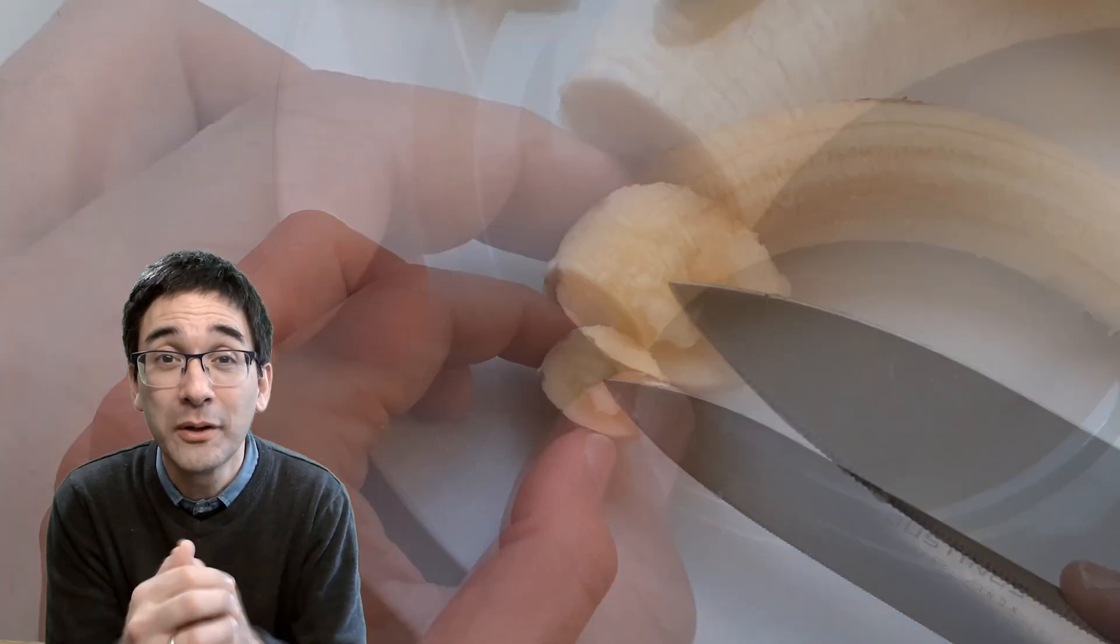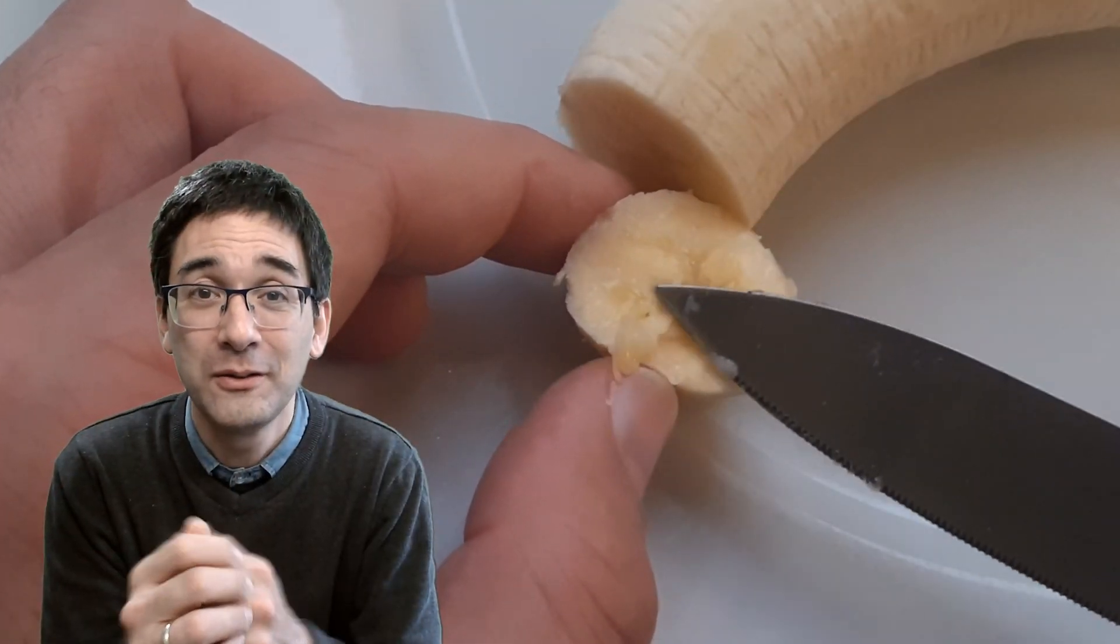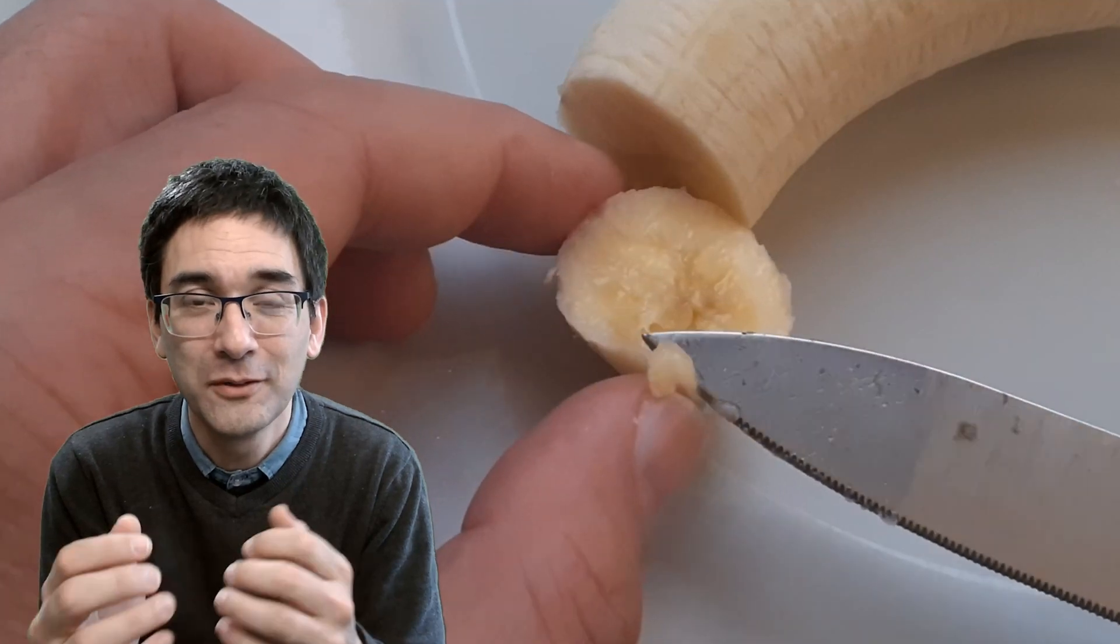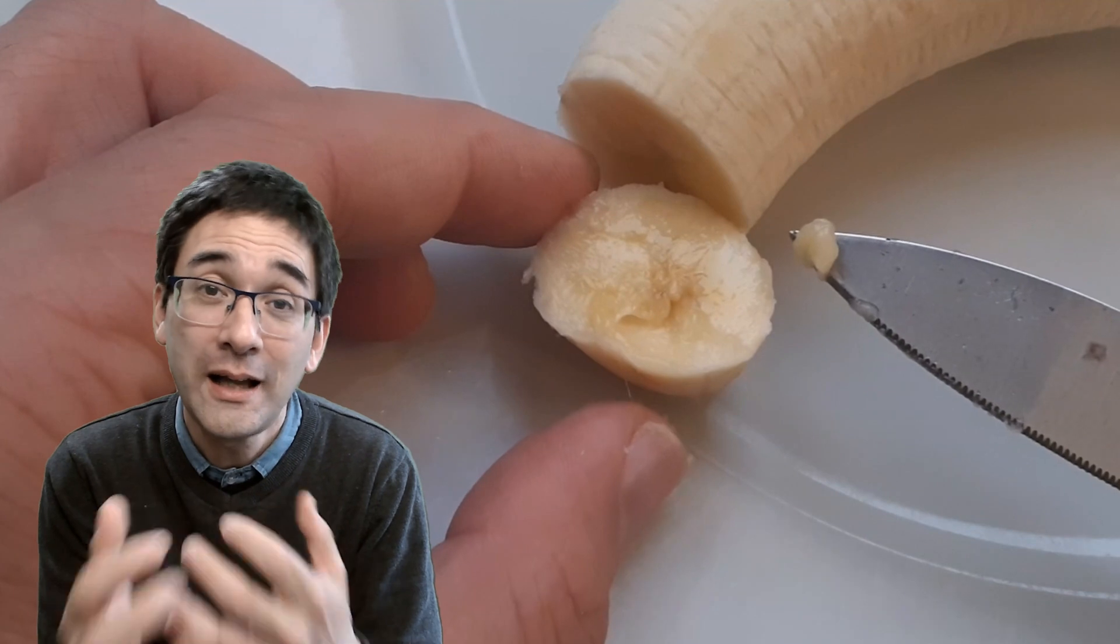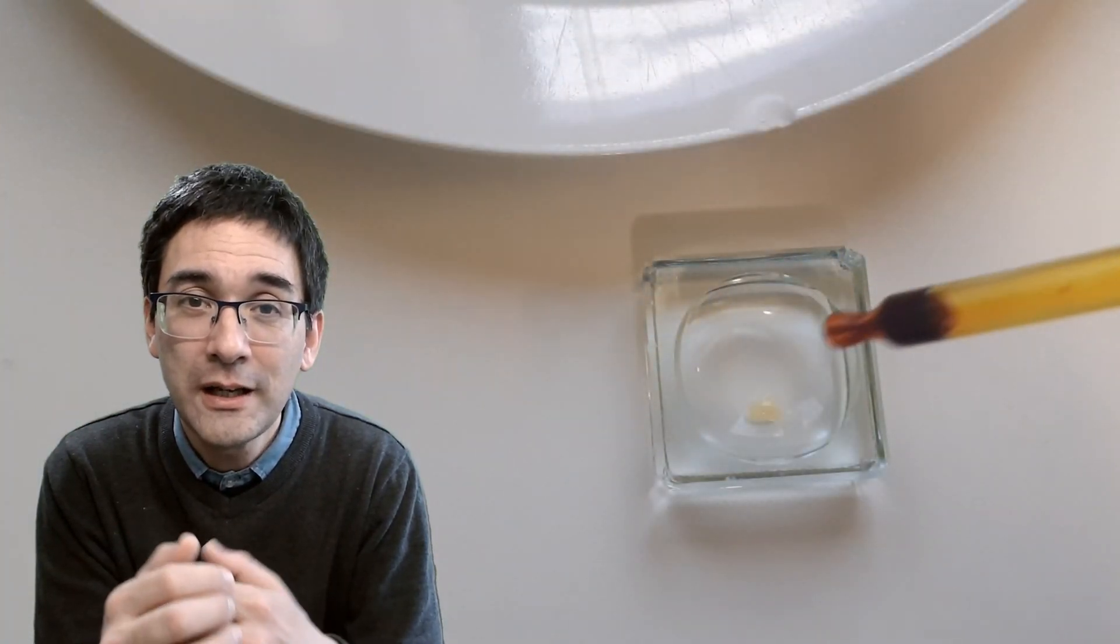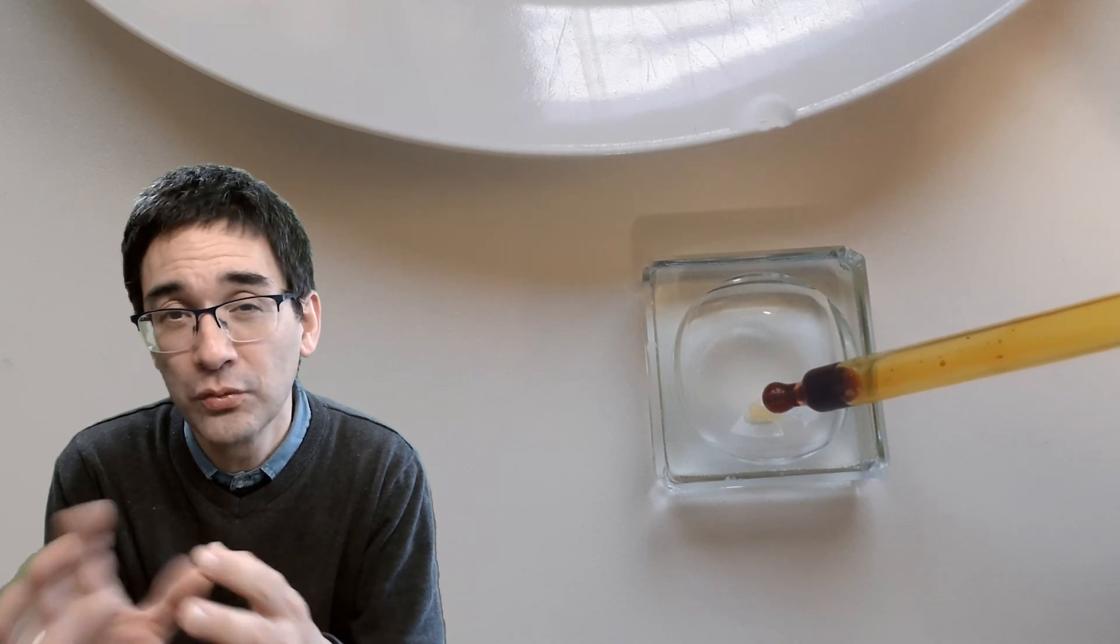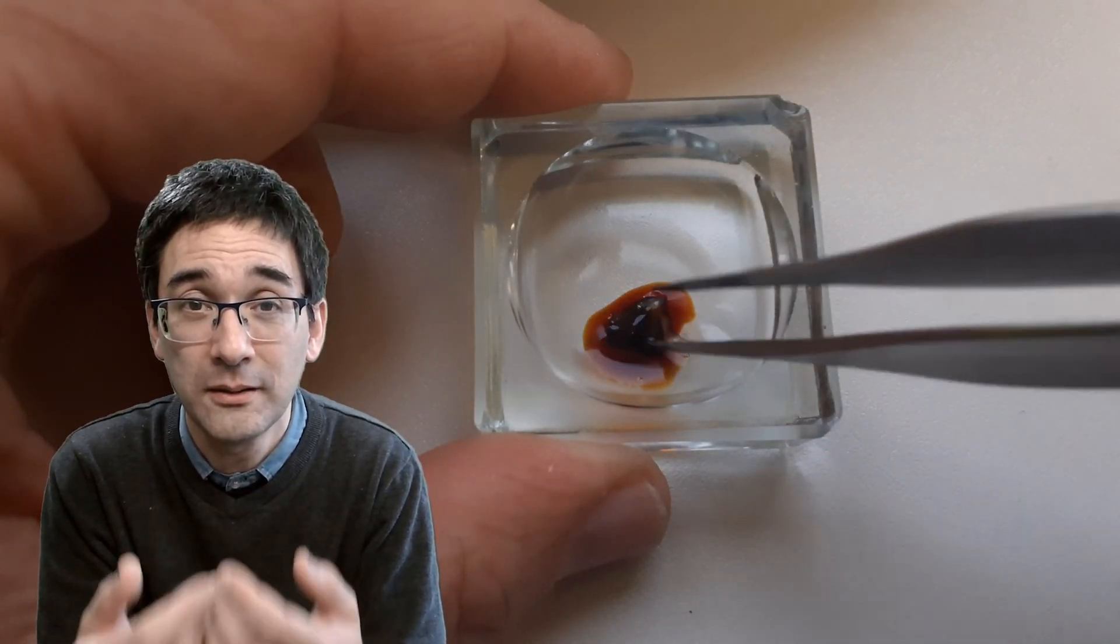So using a knife tip, I've taken a little bit of the banana material and then I mixed it with iodine. Now iodine and starch, they react with each other. The iodine is originally yellowish brownish in color, orange in color, and when it reacts with starch it turns really black.